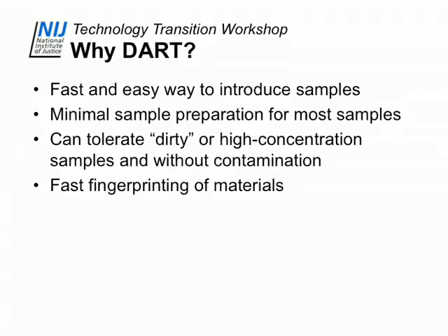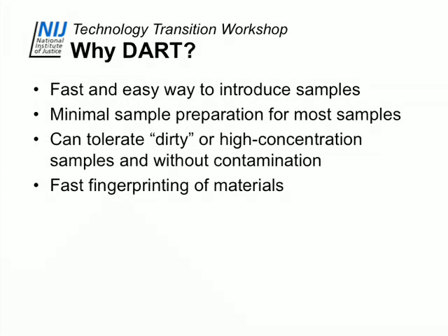Most samples don't require very much sample preparation, but some sample preparation is very helpful for many samples. If you can do something that's fast and easy to make your samples work better, then it's well worth it. I know Peter will talk about some of that. I'll talk a little bit about sample prep too, but there are many samples we can run without any sample prep, and that's convenient. The DART can tolerate dirty samples.